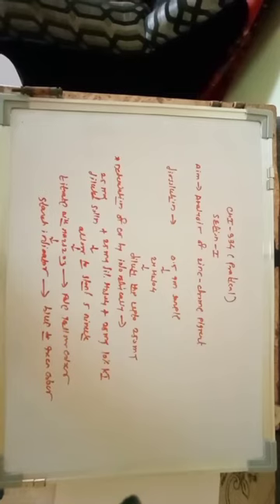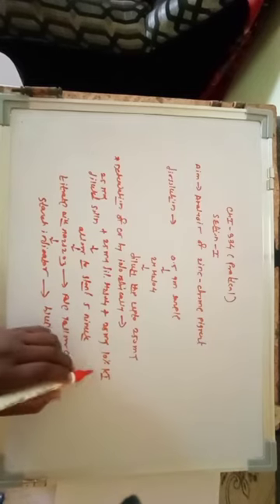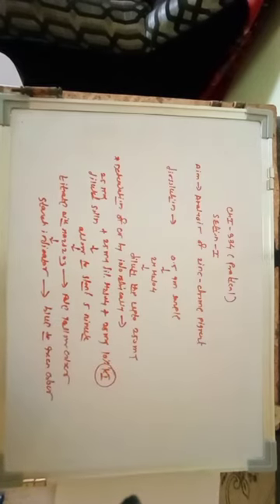So if you consider the role of this KI solution, we know that the chromium present in your solution acts as an oxidizing agent. Whenever it is an oxidizing agent, it will oxidize different compounds. So it will oxidize this potassium iodide. You should remember the conversion of this potassium iodide to iodine. That is what you can write here. So this is the procedure.